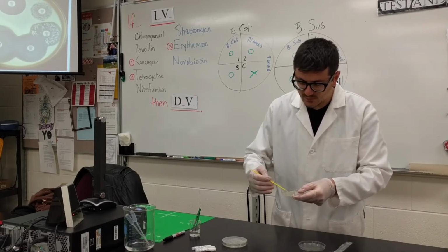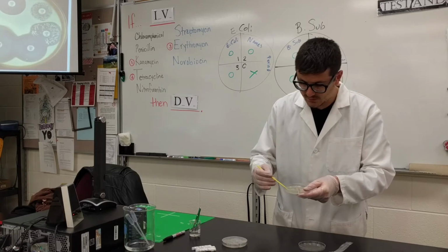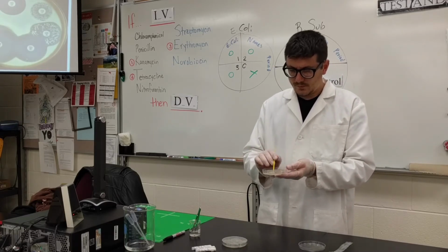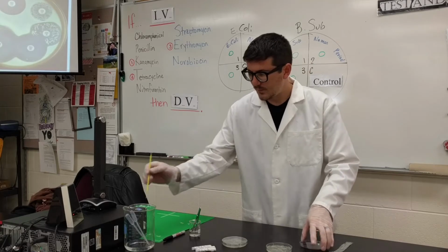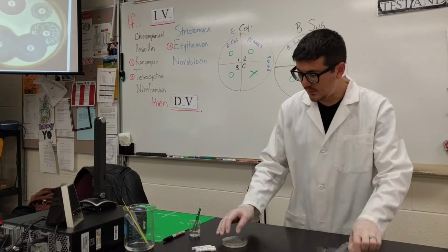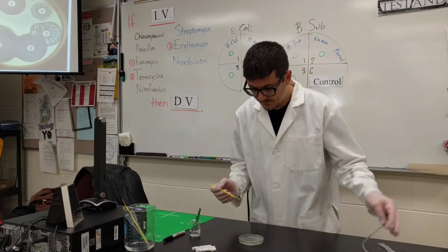Right now, it doesn't matter if I use the same loop because everything is the same right now. It's all the same agar, it's all the same bacteria. And now for E. coli.